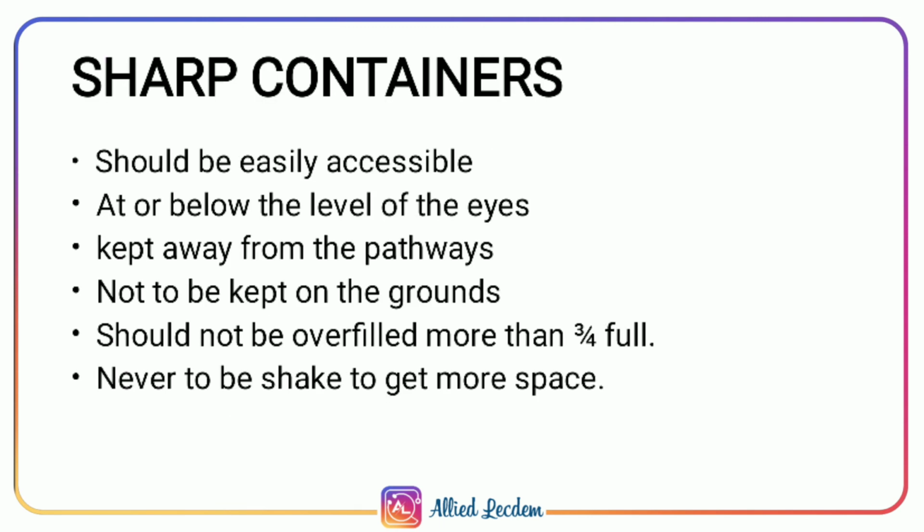And the next, sharps containers should be easily accessible at or below eye level, kept away from the pathways, not to be kept on the ground, should not be filled more than three-fourths full, and never to be shaken to get more space.